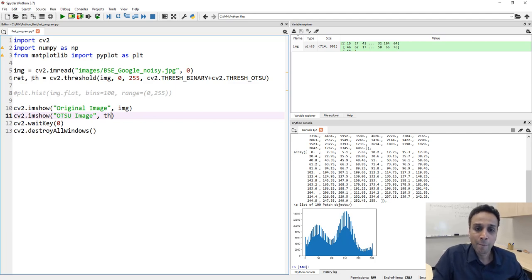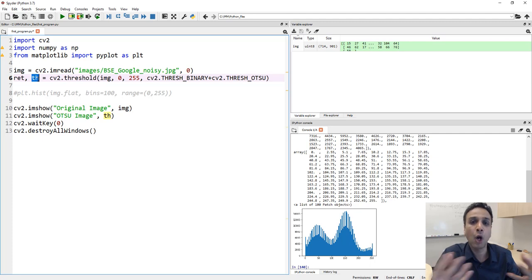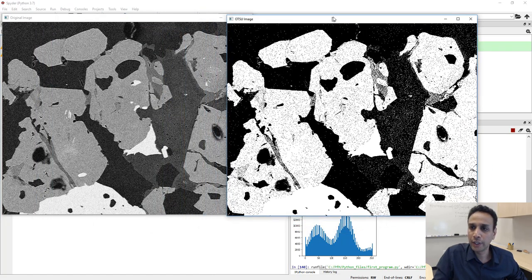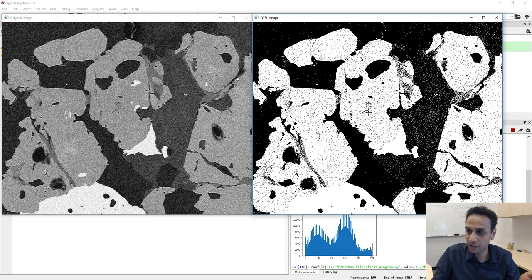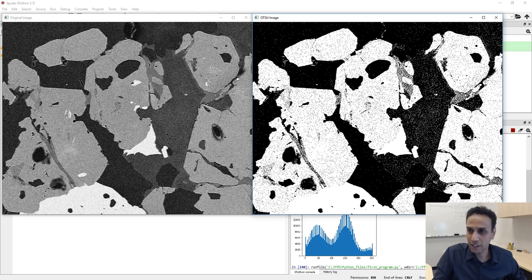Let me explain the two return values. ret is the optimal threshold value that Otsu finds — the pixel value for optimal thresholding. th is the array generated after thresholding, which is our output image. Looking at the Otsu thresholded image alongside the original, it did threshold all pixels above a certain gray level to white. However, there are a lot of single isolated pixels that are white, and we need to clean those up.